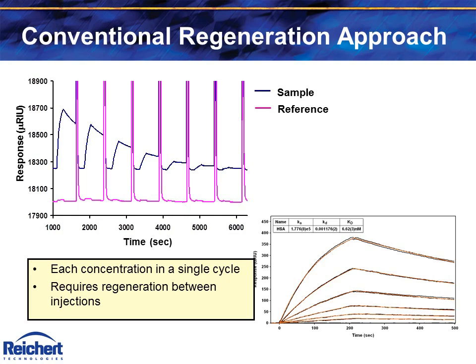The associations and dissociations for each injection are then overlaid and normalized in preparation for curve fitting or data analysis. It is important that duplicate injections show the same response. Otherwise, it is likely the regeneration step is having a negative effect on the immobilized biomolecule.